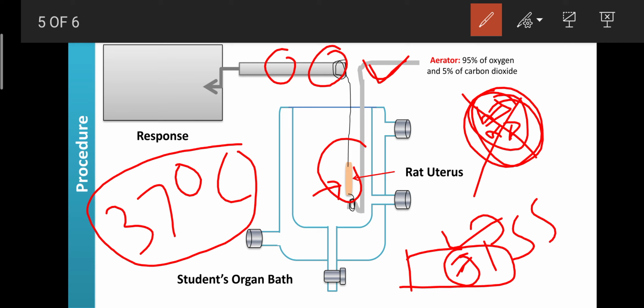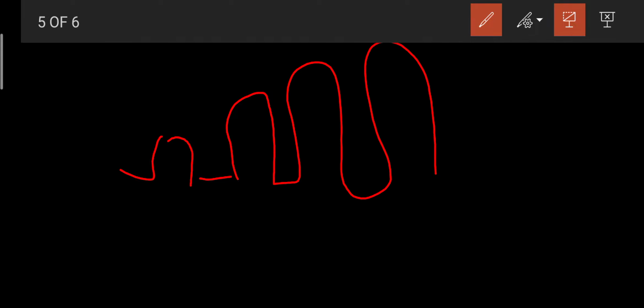So this is the method, a bioassay of oxytocin by using the rat uterus. Here, first you take the DRC of the standard by changing Ringer solution, maintaining 5 minute intervals. First you record the baseline. Then you put the drug and record the response for 30 seconds. Then wash, so all drug is removed. Once again you record the baseline for 30 seconds. Then you put 0.2 ml of standard drug and the response is recorded. Like that you record the DRC of the standard.